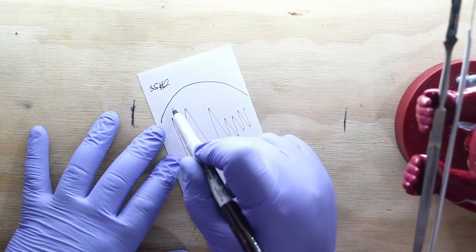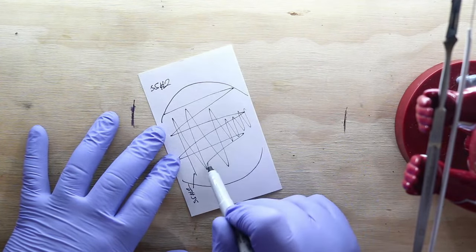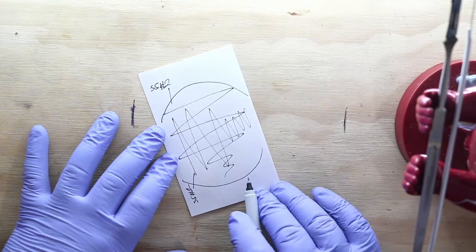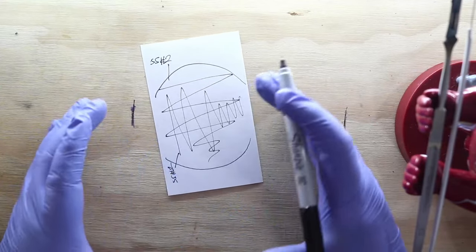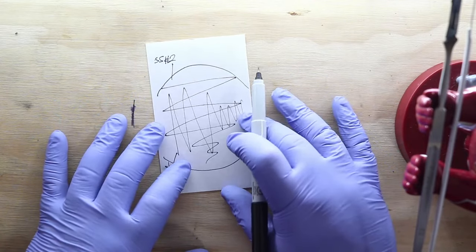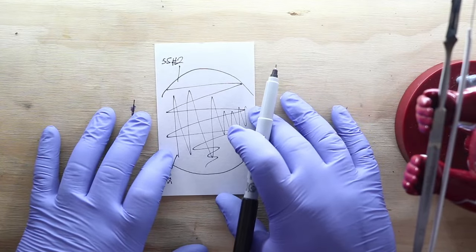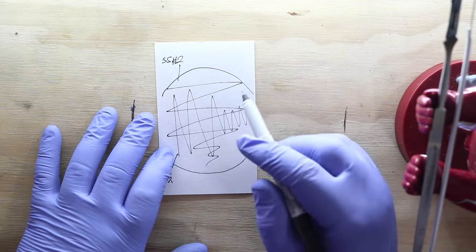I would start that here, and I would just go like this. Like that. So that's spore streak number two. Now, what I would do is look for growth from these two different streaks, and I would observe this growth every day. Anytime I see pretty much any growth, I'm going to transfer it out, especially if it's an outlier.